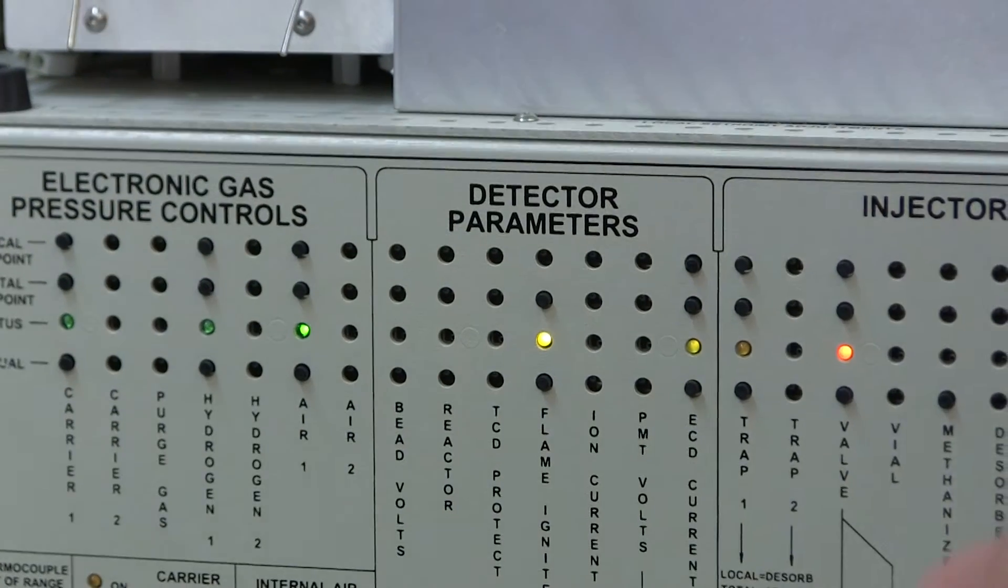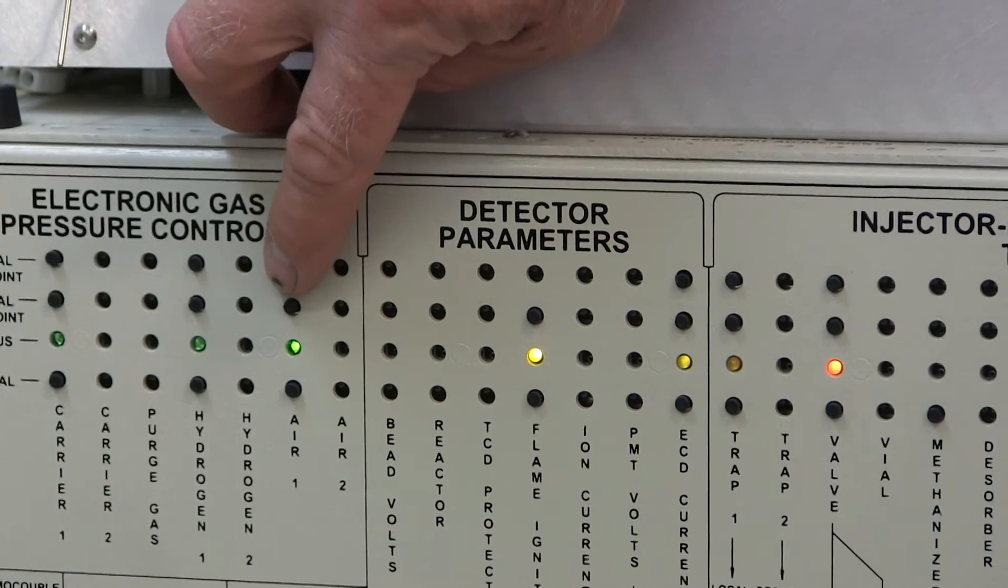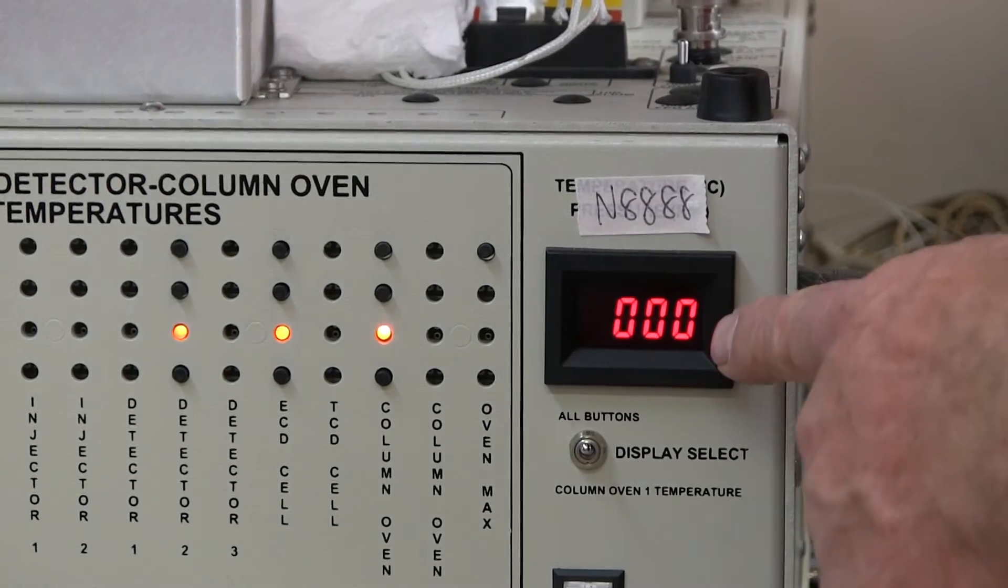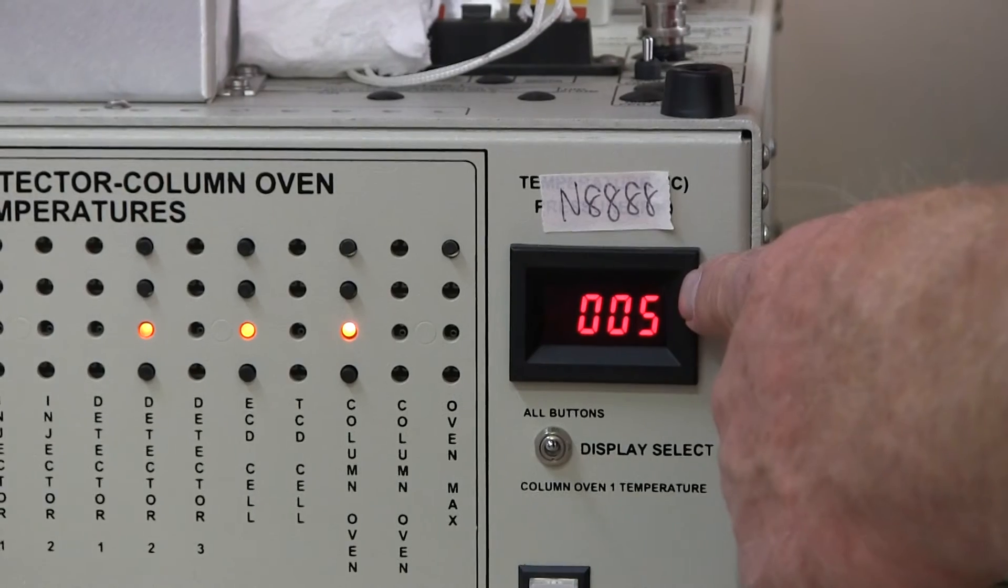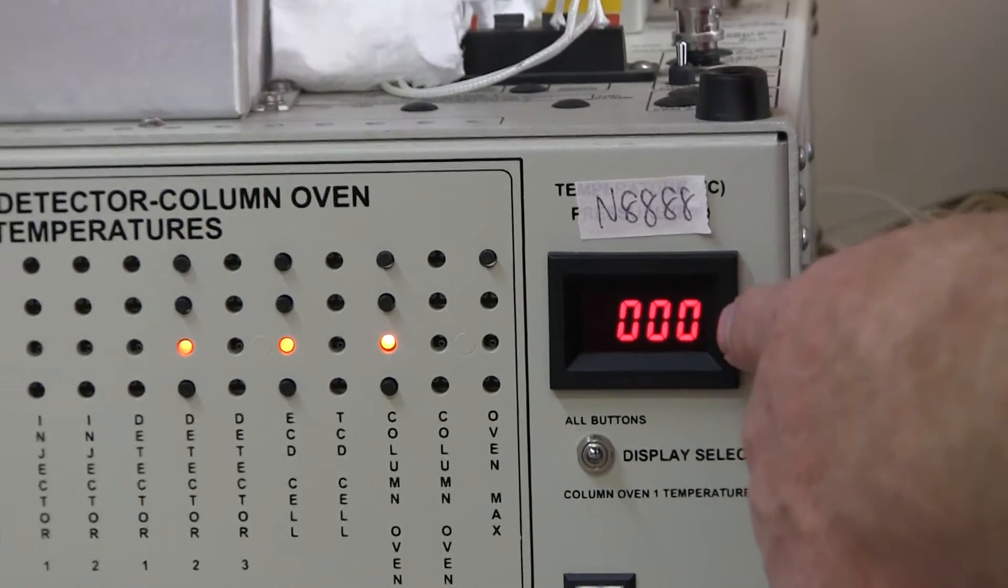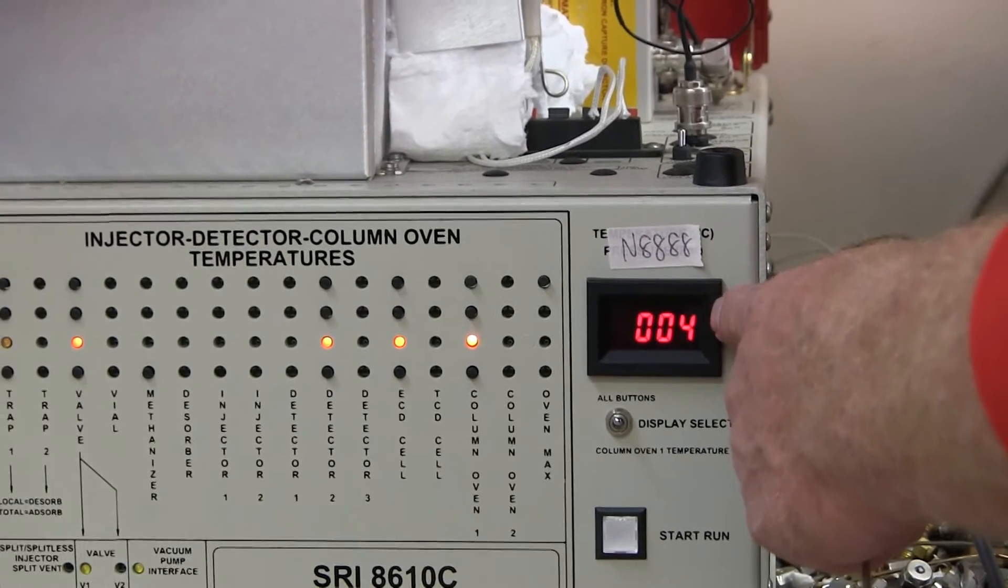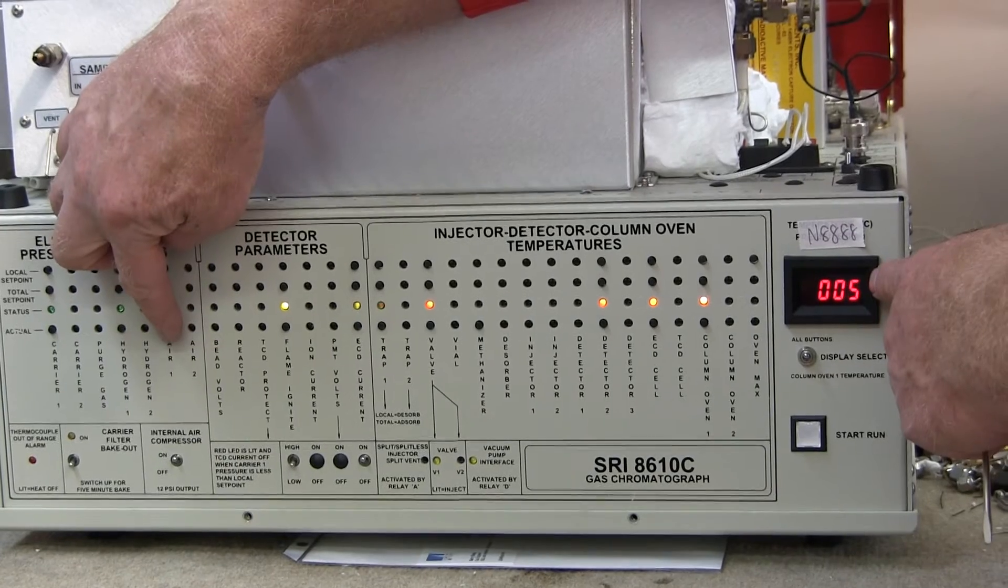The air, the top button shows you what you're setting the air to. In this case it's 5 PSI. When I push the top button, it shows 5 PSI on this display. If I push the bottom button, it also shows 5 PSI. The top button is the set point, what we want it to be, and the bottom is the actual.